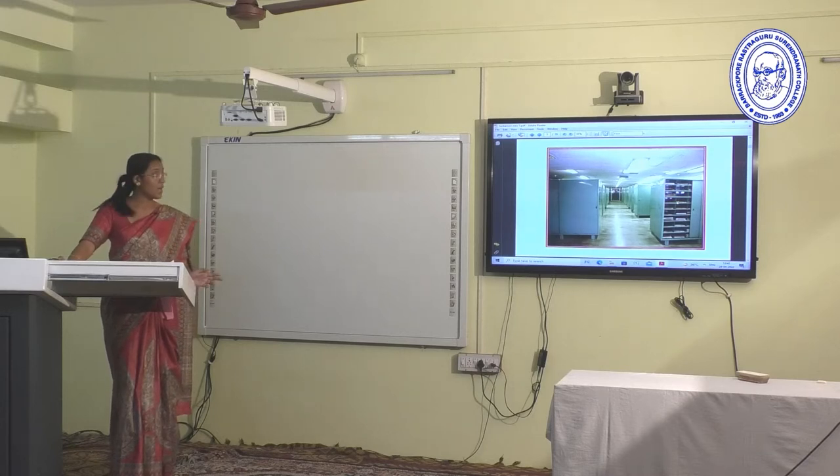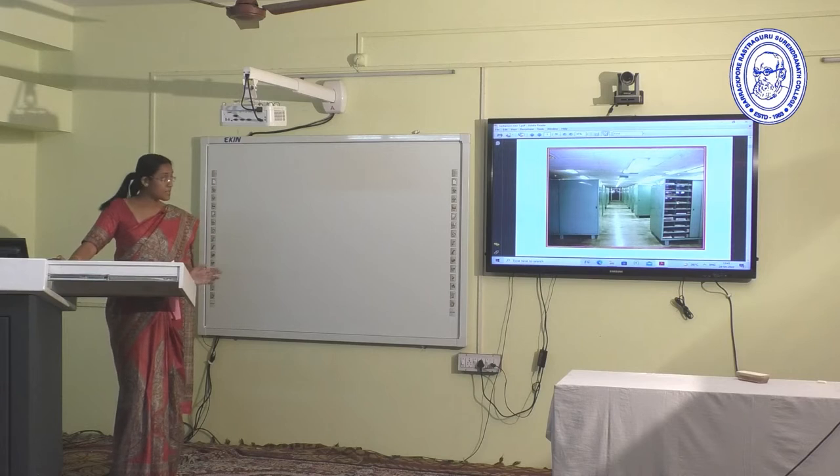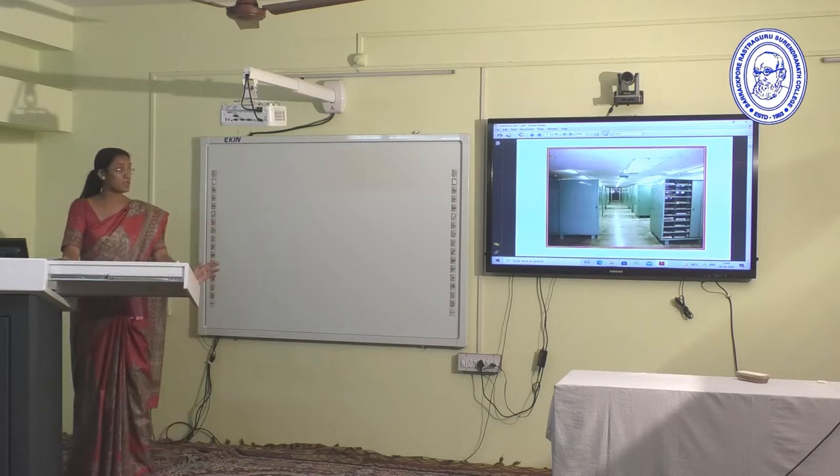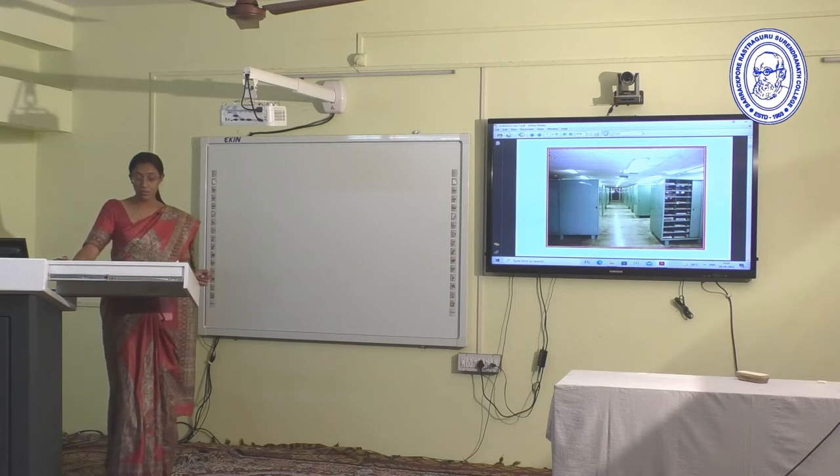This shows the pigeon hole almirahs where herbarium specimens are kept and preserved in the Central National Herbarium, situated in Acharya Jagadish Chandra Bose Indian Botanic Garden.